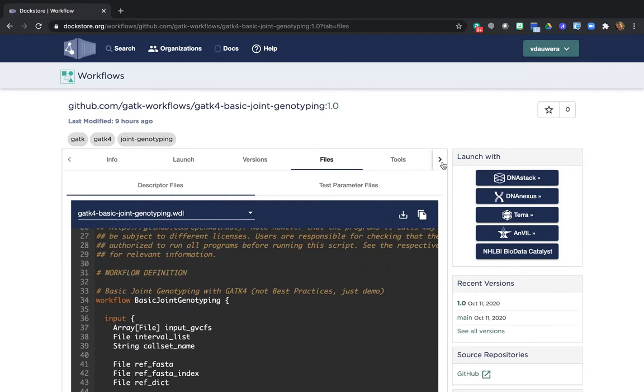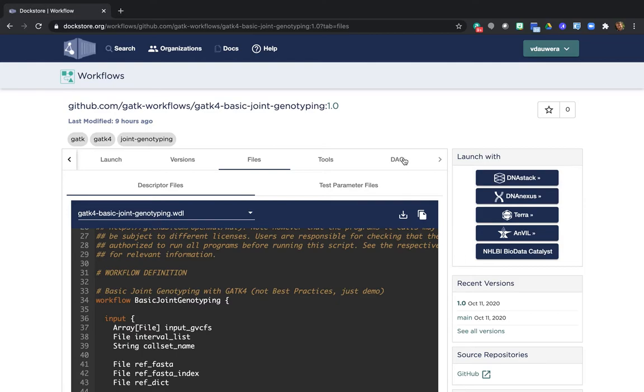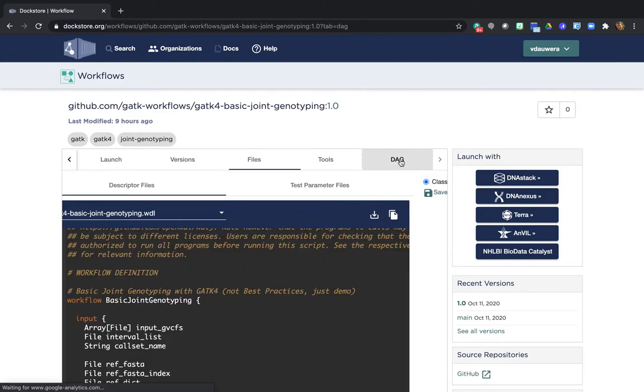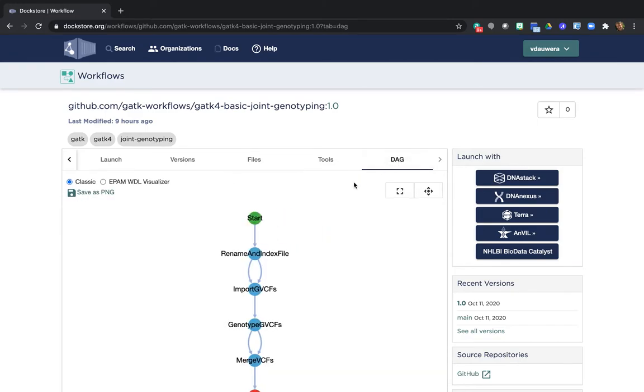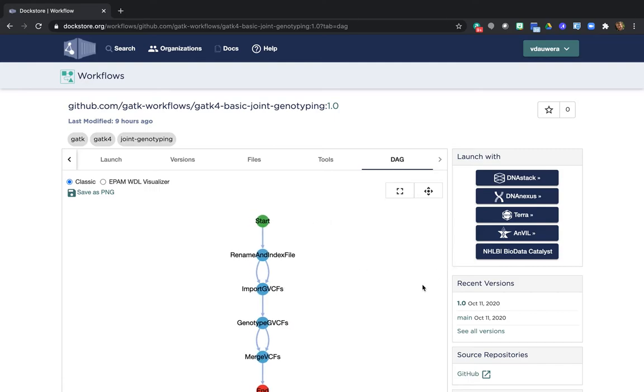You can also get a visual representation of the workflow. By clicking the little angle bracket up here, you get access to the DAG tab, which stands for Directed Acyclic Graph. And this shows you the four steps of the workflow. Now in this case, this particular workflow is entirely linear, so the graph isn't that illuminating compared to just the text documentation. But when you have a more complex workflow with branching points, for example, it can be really helpful to see the visual.